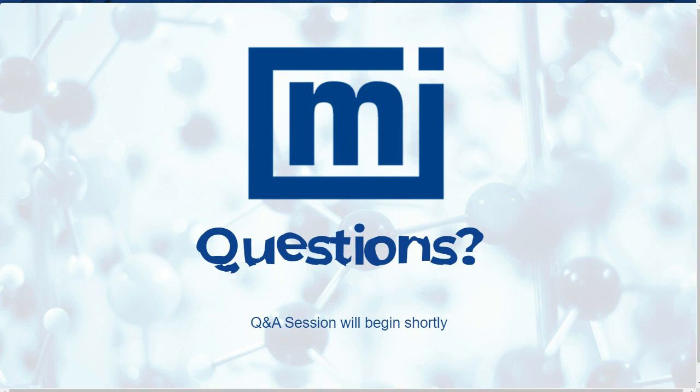Great, thank you. For our next question, is there a way to measure the tensile strength of the powders?